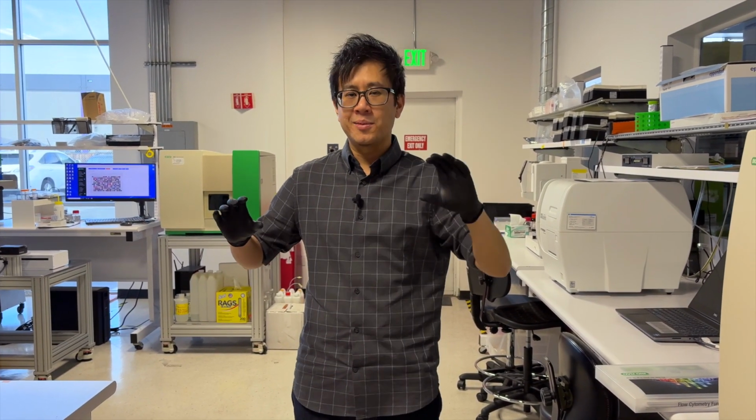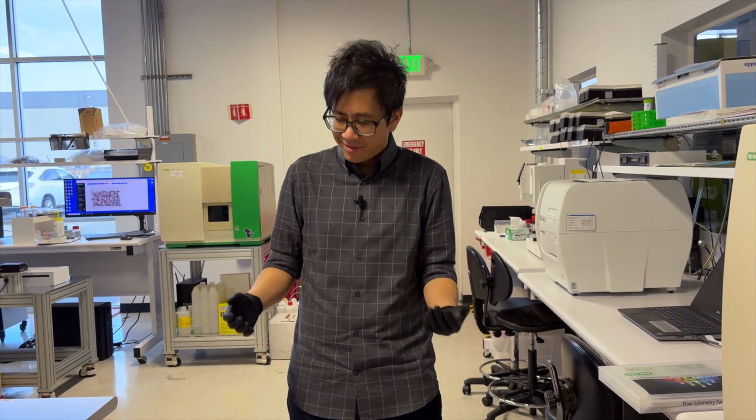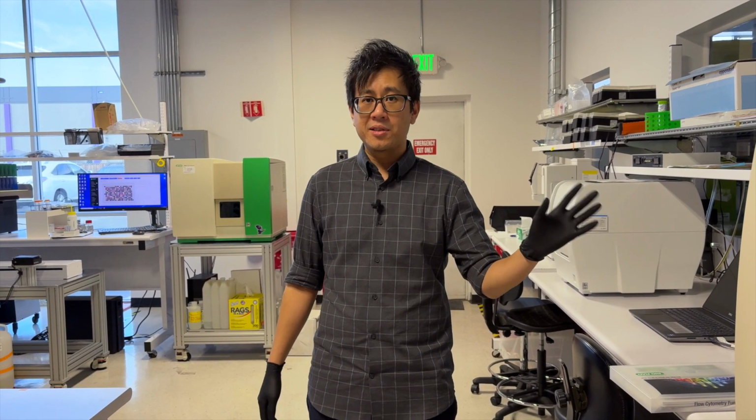Scientists can put together these blocks. I'm going to screen these drugs against these cell lines at these concentrations. And the software makes it really easy. At the same time, scientists will always break that workflow because they should. It's how you do new things. And so you wouldn't necessarily want to support that with strict engineering.